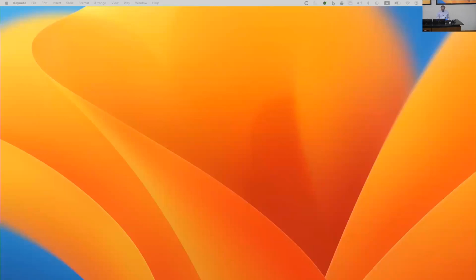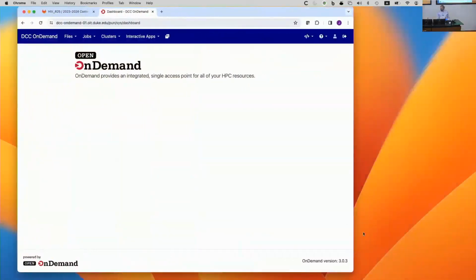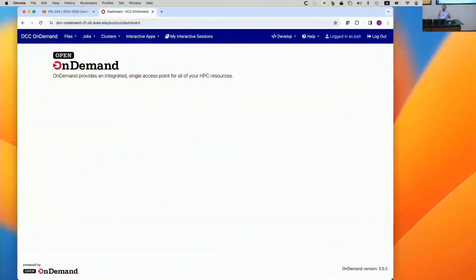Two Ns is starting to look pretty bad, and once you get up to three Ns, that's a total mess. So that's one way of thinking about why you might want to throw out any reads that have three Ns or more.